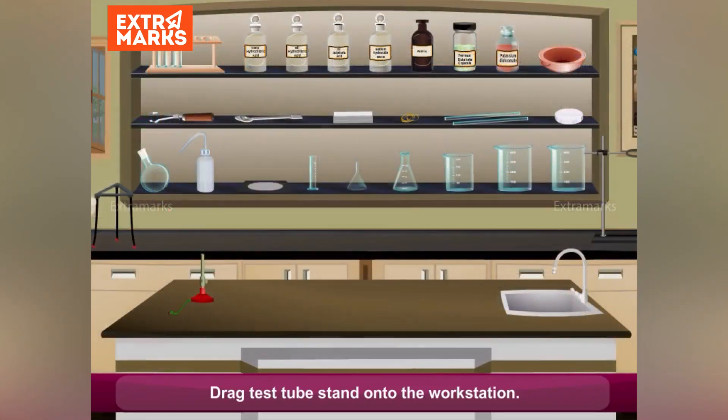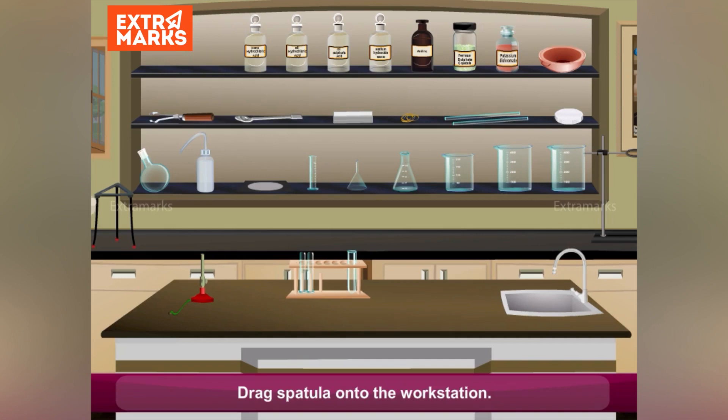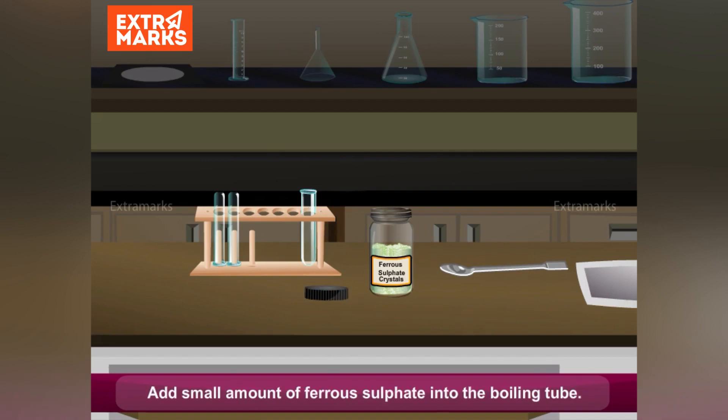Drag the test tube stand onto the workstation. Take out one boiling tube from the test tube stand. Drag the spatula onto the workstation. Drag the ferrous sulphate bottle onto the workstation. Open the bottle of ferrous sulphate. Add a small amount of ferrous sulphate into the boiling tube.